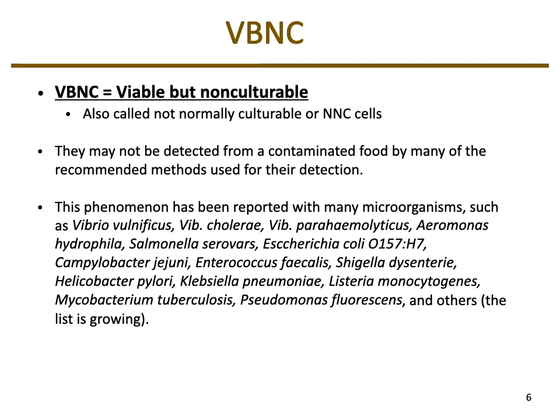So this term of viable but not culturable is abbreviated VBNC. In the food microbiology world, you see that and you know. In some cases, it's called not normally culturable, so NNC. Those are terms that you should know. And there's a whole list of these organisms that, given the normal recommended methods, aren't detected. You would have to do additional things to either supplement the media to allow them to grow, or use different techniques where you're just looking for remnants of genetic material, which would be much more successful in being able to determine whether they're there or not.